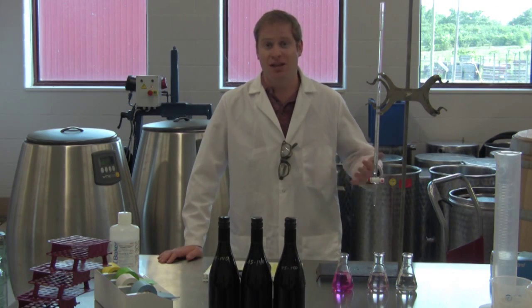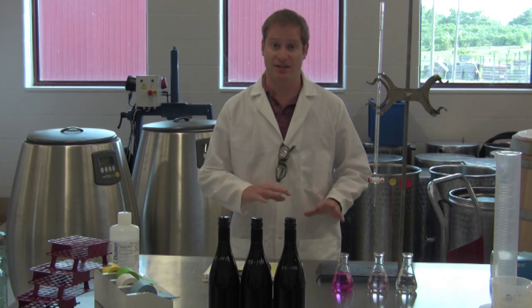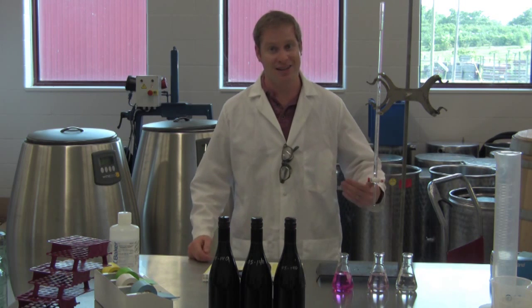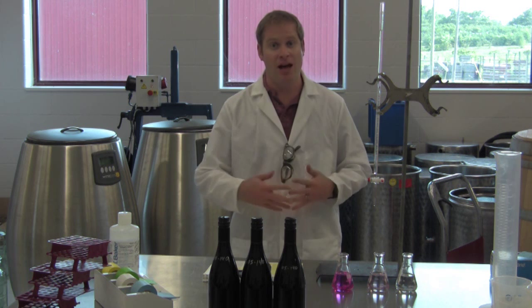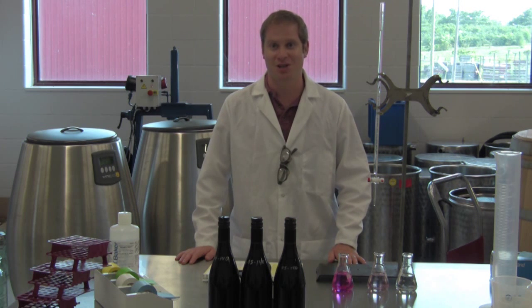Titration is also a technique that we're going to use a lot through the rest of these videos in other analyses. So it's important to understand the technique, and we're going to talk a lot about endpoints in this video. So stay tuned, and we're going to measure some titratable acidity.